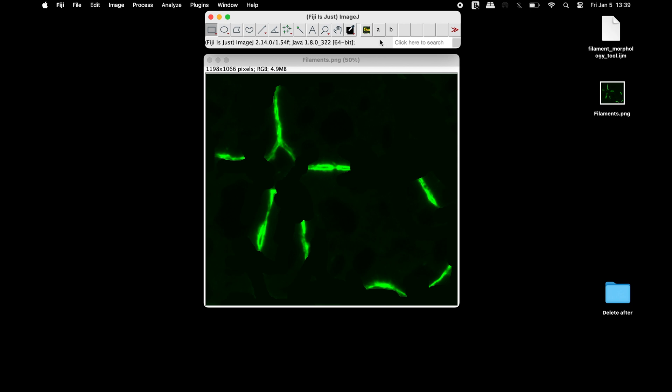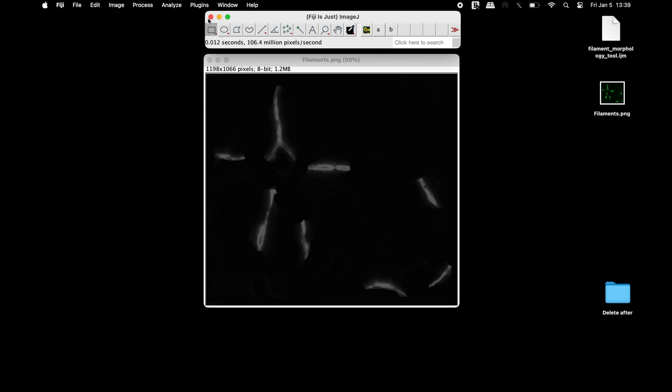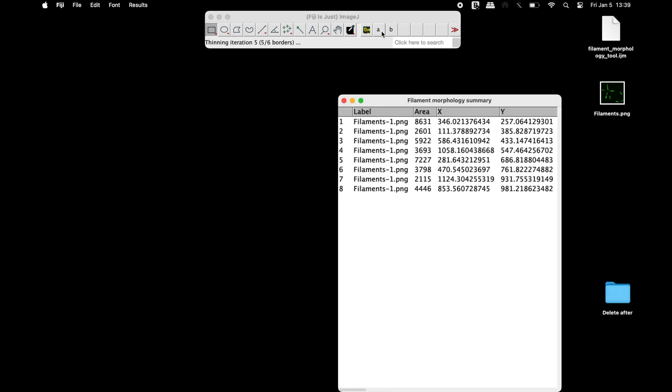The next step is to change the RGB image type into an 8-bit image. Now, make a left click on the icon A and wait until the macro has completed the analysis.